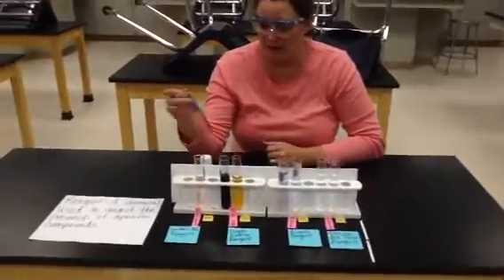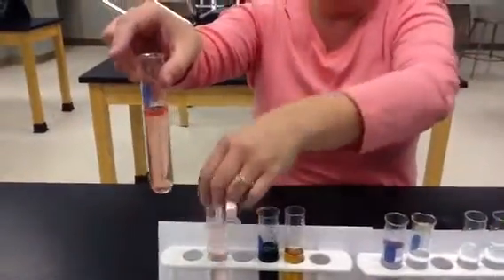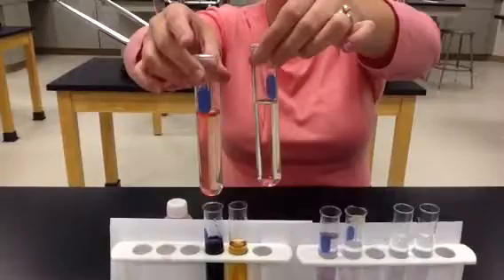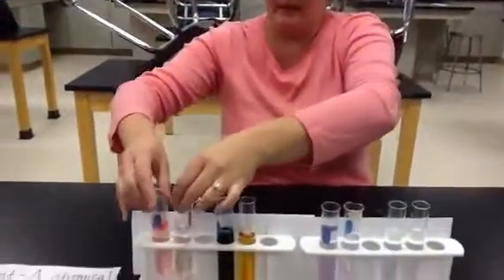Let's look back at our fat test. Notice how there's this layer right here, and there's no layer in here. That right there tells us that it's positive for lipid. And I look forward to doing this lab with you.